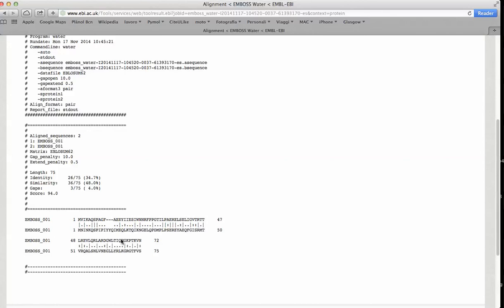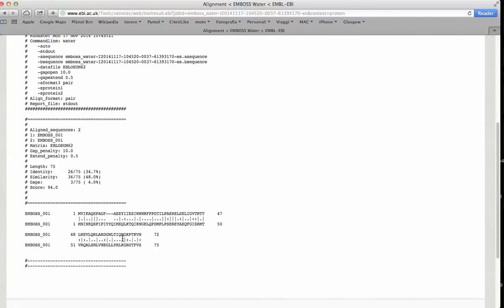In this case, it seems that the similarity is concentrated in one part of the two sequences that could be a domain. In fact, in this case, it is a domain that is shared by these two sequences.